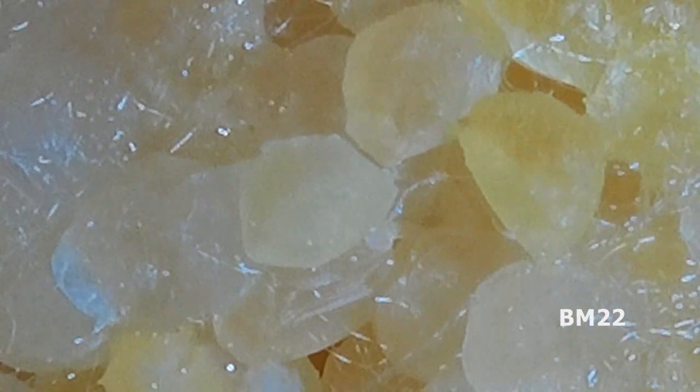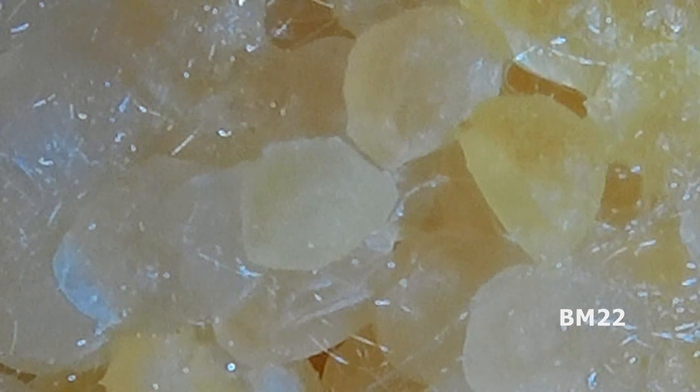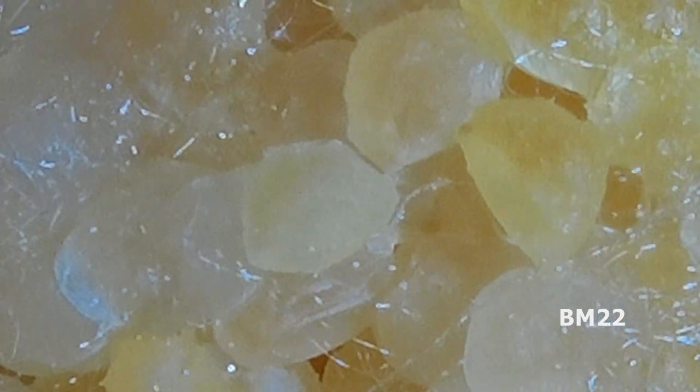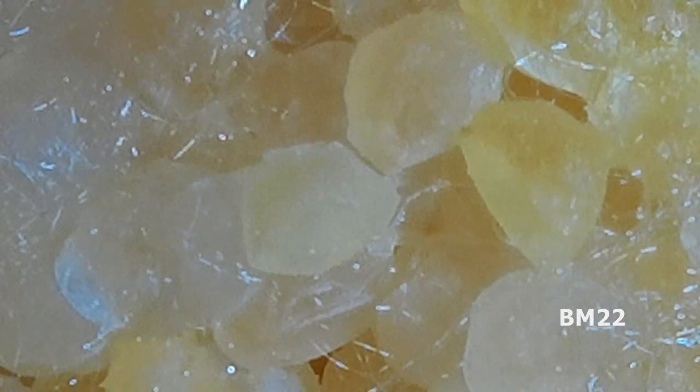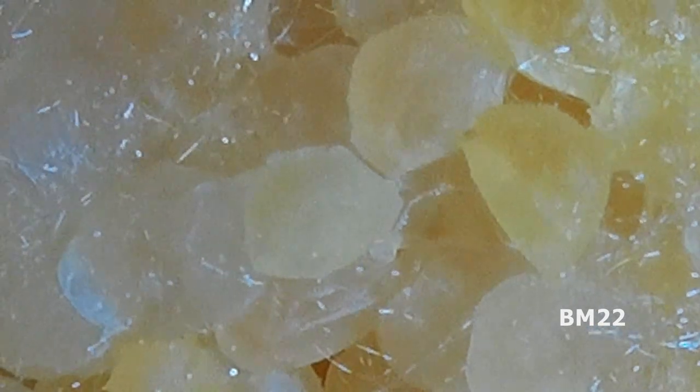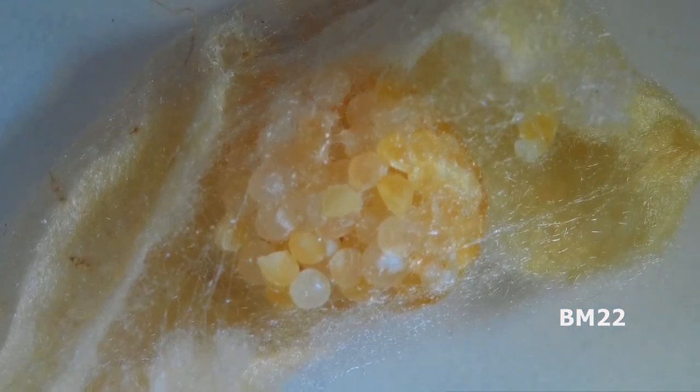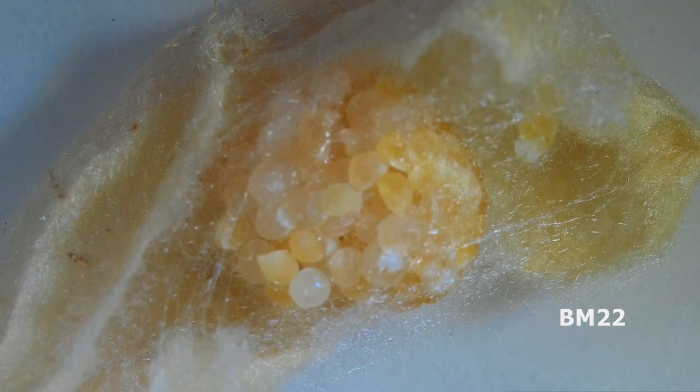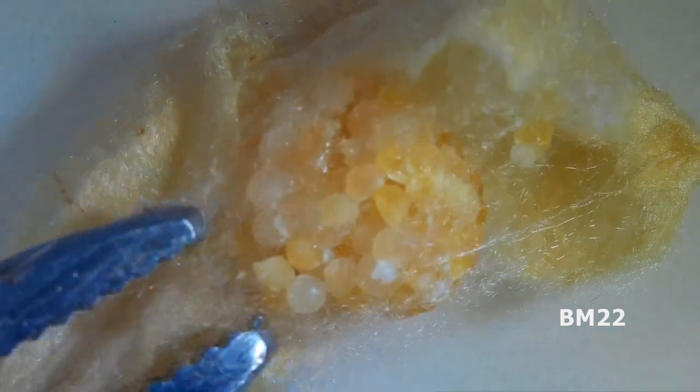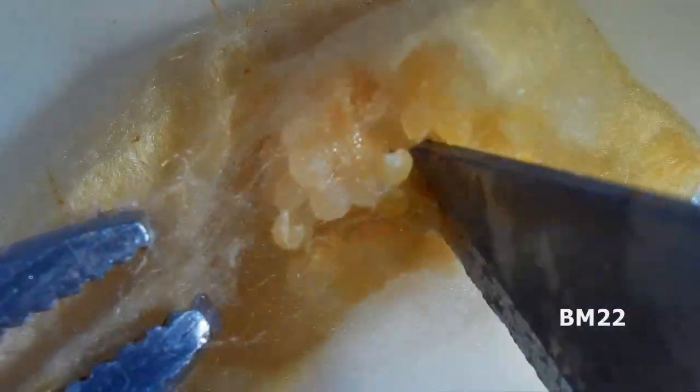But now that we're looking inside, we can see something is terribly wrong. Or I mean, not from our standpoint, it's terribly wrong from the spider's standpoint. Half of the eggs or maybe a third of the eggs in here look good. The other portion of the eggs looks damaged and they're slimy.